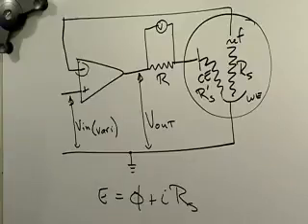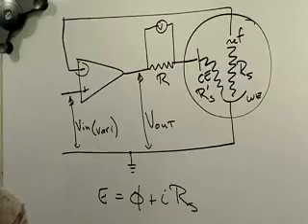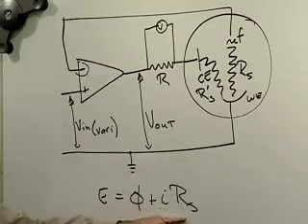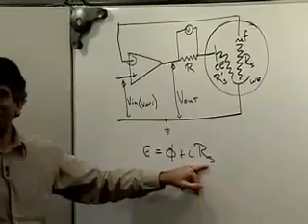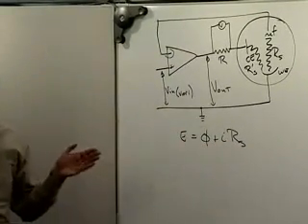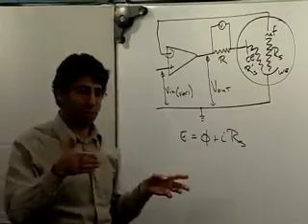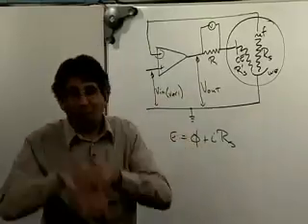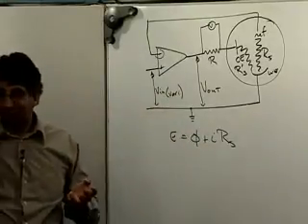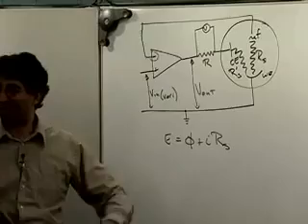The way these resistance compensating circuits work is they apply a current or potential, depending on how you want to think of it, that's opposite to this IR current. It goes in the opposite direction. You put the current in the other direction. And it's set up so it will measure it so it exactly equals the opposite of this number. Now, if you do that, you've removed all the resistance from your circuit, and you end up in oscillations. This works really well when all people used for electrochemistry were mercury electrodes, because when the potential goes uncontrolled, you blow up your drop of mercury, you back off a little bit on your IR compensation so that you have a tiny little value here, and the next drop of mercury comes down, and everything is fine.